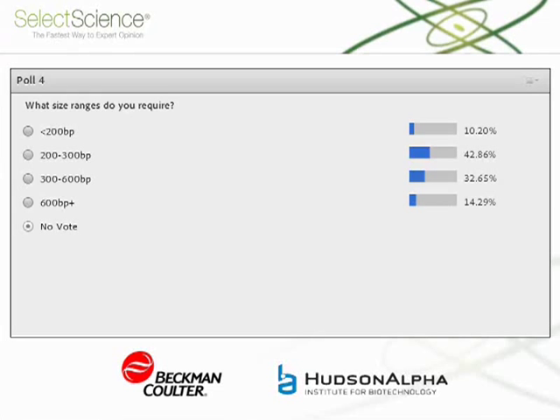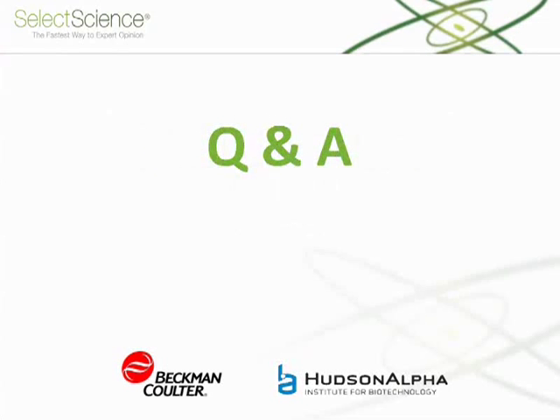So let's move on to the question and answer section. We'll ask you a couple of questions we've received. So, Sean, the first question we had was, the growing technology of nanopore sequencing does not need any sample preparation. How do you think this will affect lab automation in next-generation sequencing?